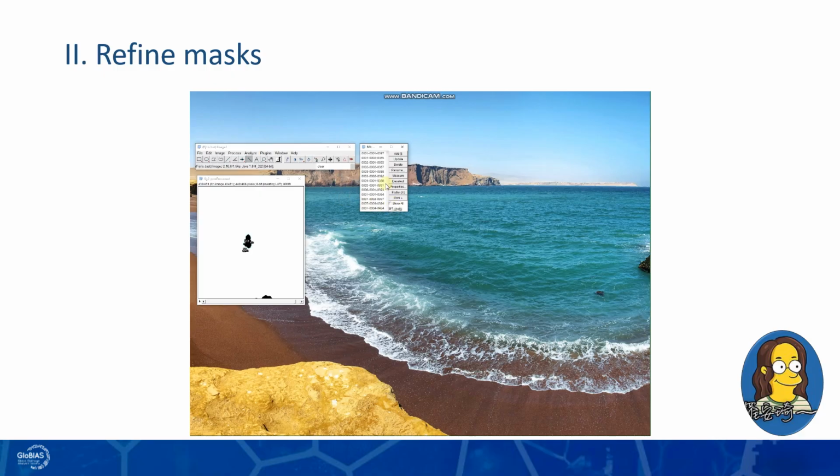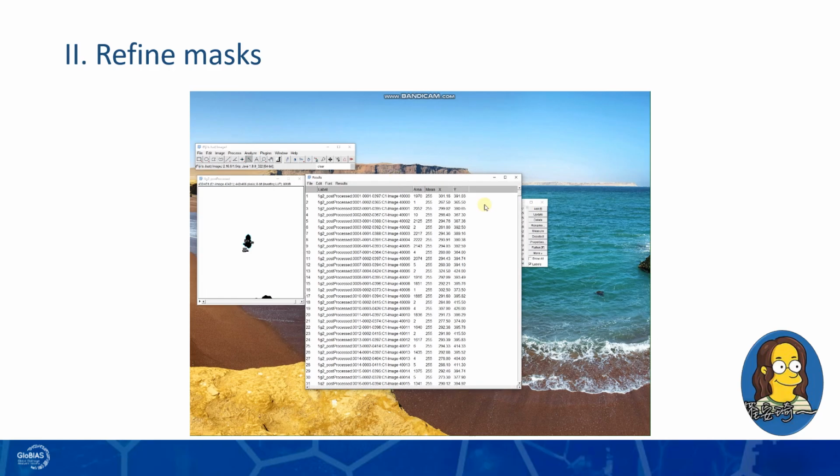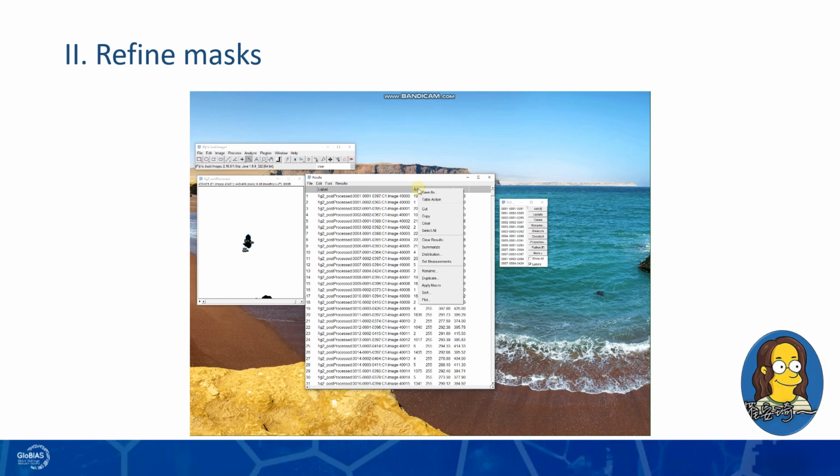After all ROIs have been added to the ROI Manager, click Measure to obtain their area measurements. Next, sort the area column in the result table, and look for a clear gap between the large and small objects. In this example, row 551 appears to be the largest debris candidate.